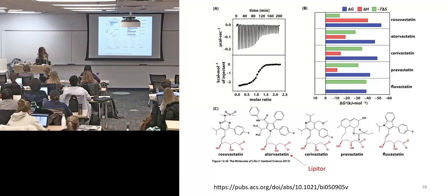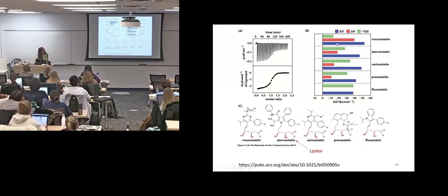So this lets you see, if you look at the relative size of the bars, you can think about the binding of those two things. What is the greater contributor to delta G? Is this an enthalpy driven or entropy driven reaction?